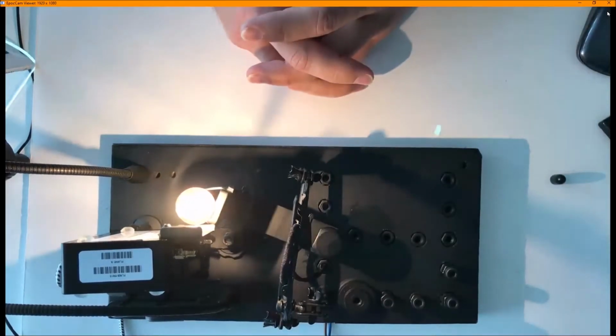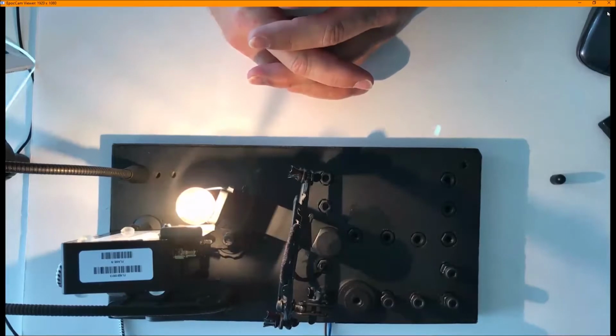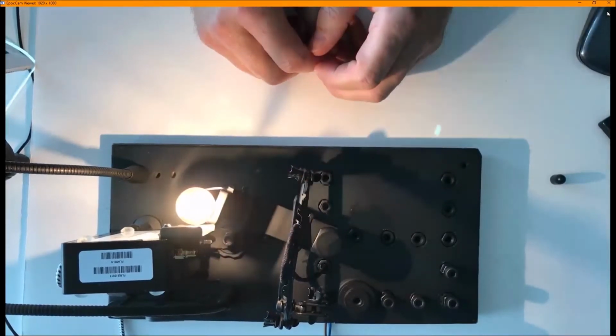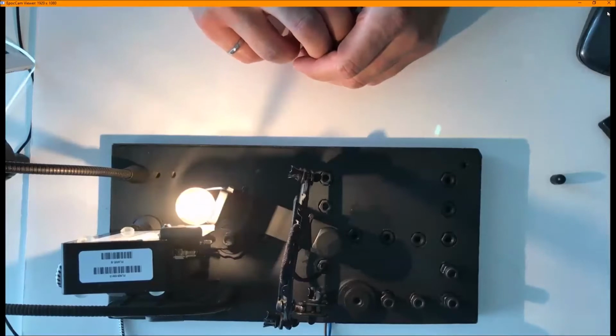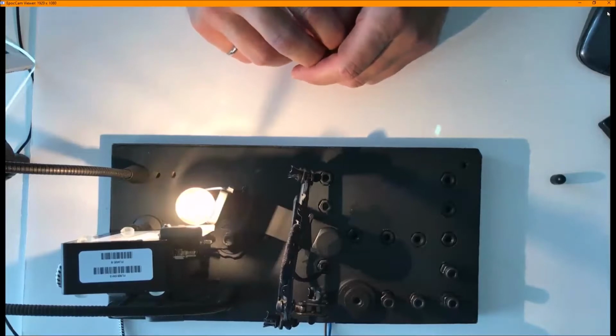Here we will measure diffuse reflectivity, meaning that light is reflected diffusely in many directions, by opposition to specular reflectivity, where light is reflected in a particular direction like a mirror. We just want to measure the spectrum of the reflected light, so diffuse reflection is okay. I have grouped the reflection items in three families. Regular surfaces, meaning no fluorescence or phosphorescence, and then the fluorescence group, and lastly, the phosphorescence group.